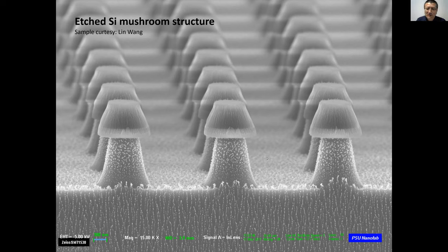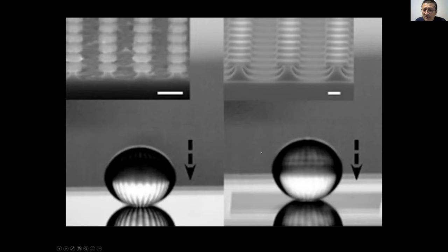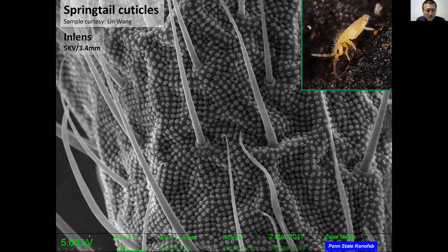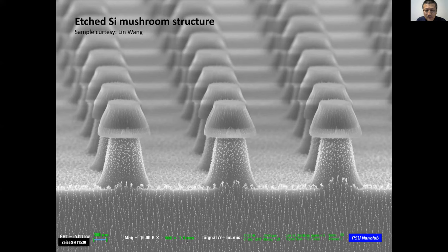To get a good image of this mushroom structure — features around one micron — you need the right beam voltage, working distance, and detector. Here I use in-lens detector at 5kV with a 3mm working distance, and similarly 5kV with 4mm working distance for a related image. These are very typical starting conditions for SEM imaging.